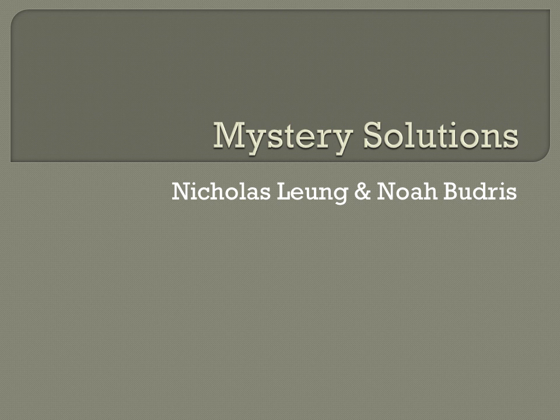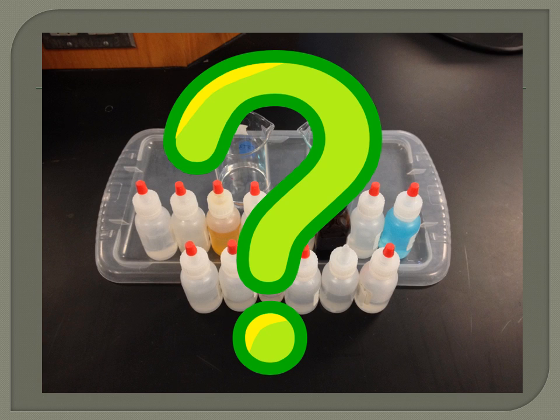This is the Mystery Solutions Lab. The objective is to identify 14 unknown solutions through the use of differences in their chemical and physical properties.